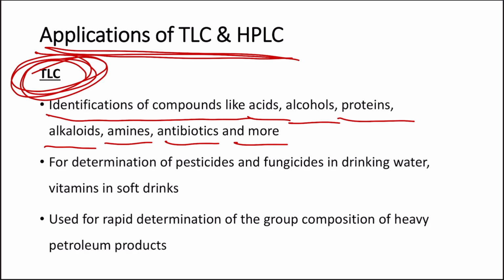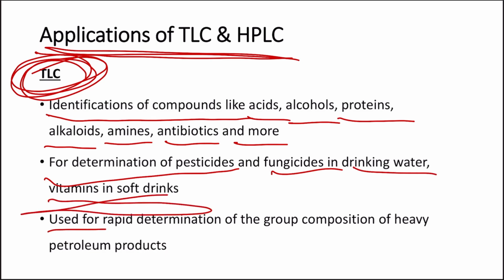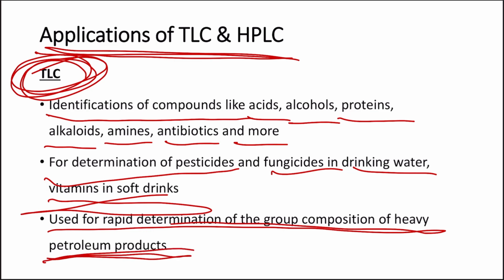Then it is also used for determination of pesticides, as seen in gas chromatography, and fungicides in drinking water. Then vitamins in soft drinks. It is used for rapid determination of group composition of heavy petroleum products, like asphalt and pitches. For that we can use it.